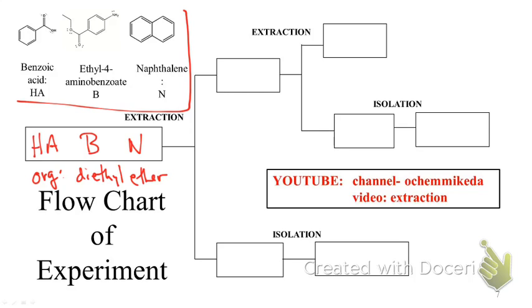What wouldn't mix with diethyl ether? Makes up 80% of the planet. Water. Okay, what's the problem with adding water? Are any of your compounds soluble in water? No. So I can't add just water. I'm going to have to add something else.